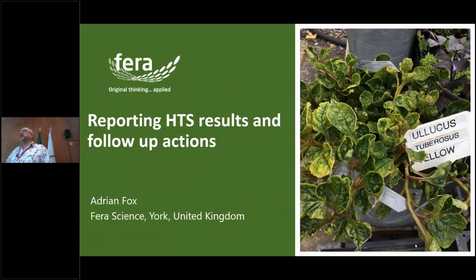Yes, we use it in research. A lot of the things I'll talk about here will apply to the outputs of research work in the same way they will apply to routine diagnostics. I suppose we need to define what do we mean by routine. We're still not at a point where every sample that comes into virology goes into HTS.